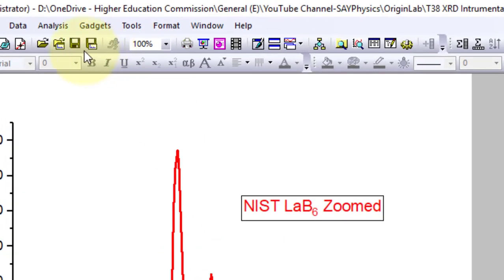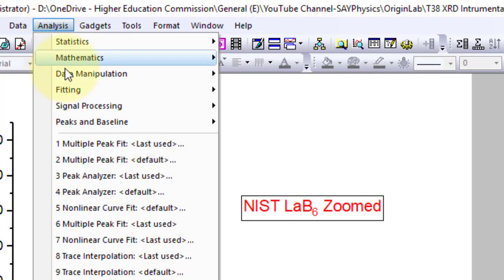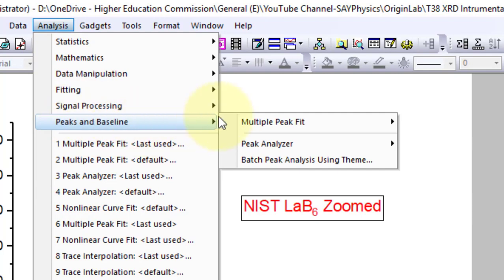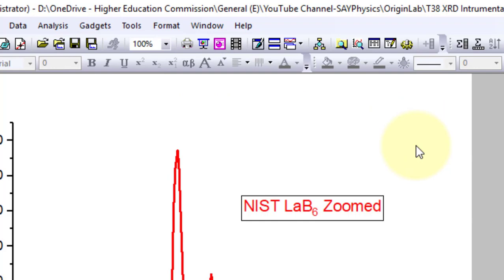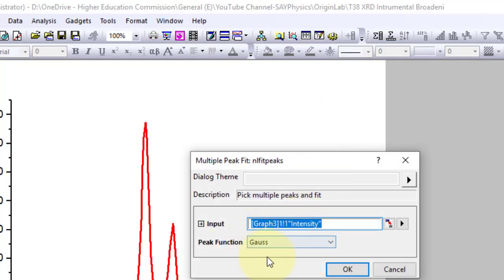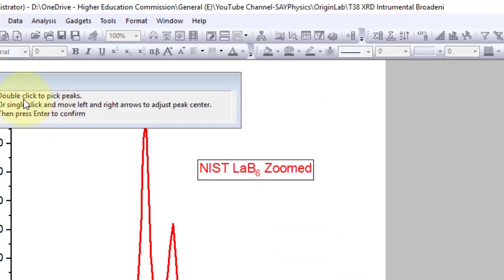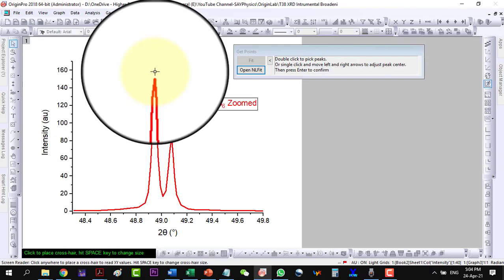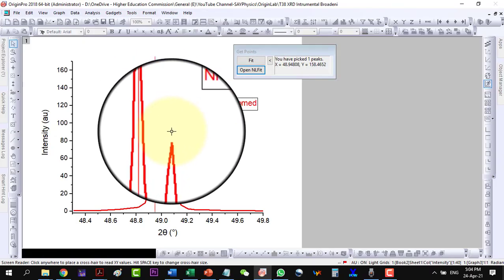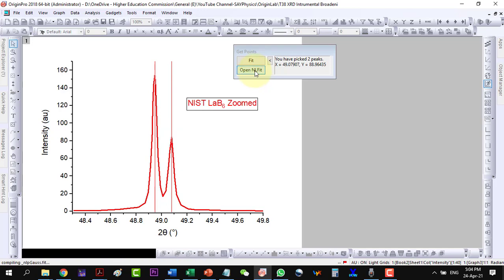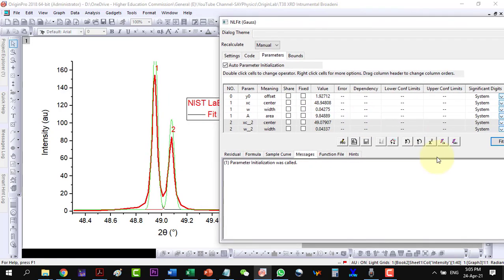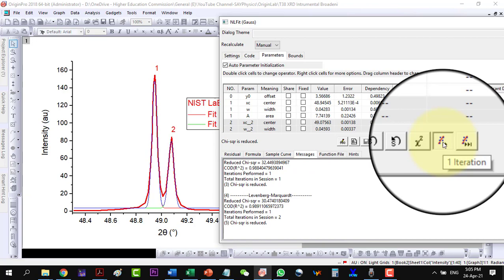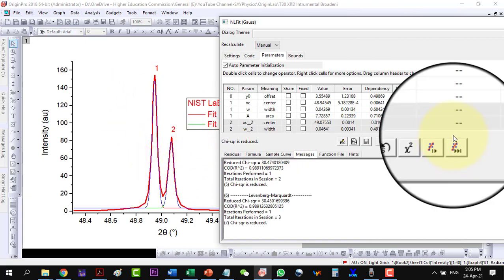To find its FWHM, go to Analysis, Peaks and Baseline, Multiple Peak Fit and Open Dialog. Go on with the Gaussian function. Double click to pick the peaks. Open non-linear fit. Click few iterations to see that fitting is good. Then fit until converge.